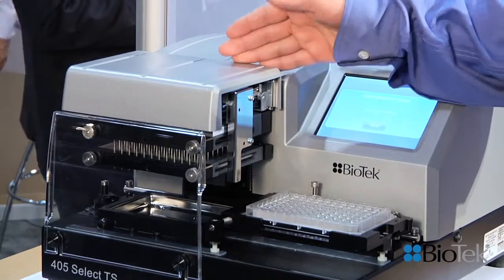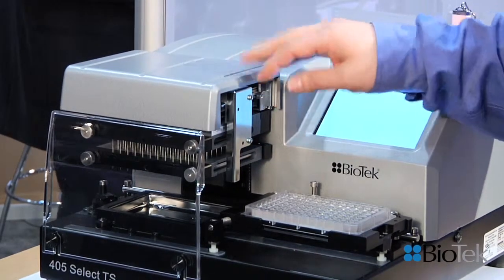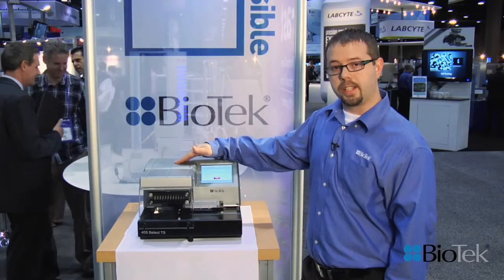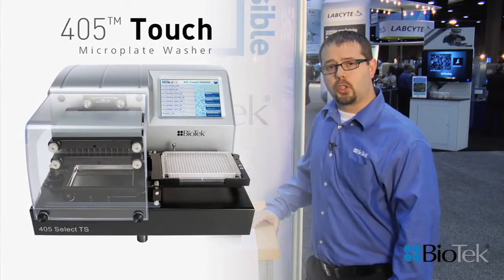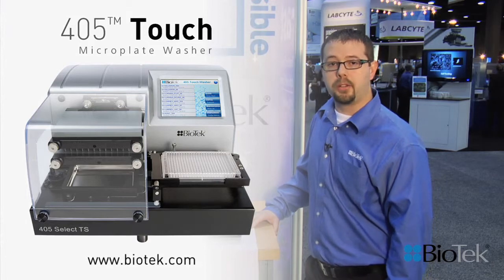The combination of this new patented Verify Technology with our Ultrasonic Advantage sonicating water bath gives the only solution out there for onboard detection, cleaning, and maintenance of your wash manifold. Thank you for joining me, and for more information you can visit www.biotek.com.